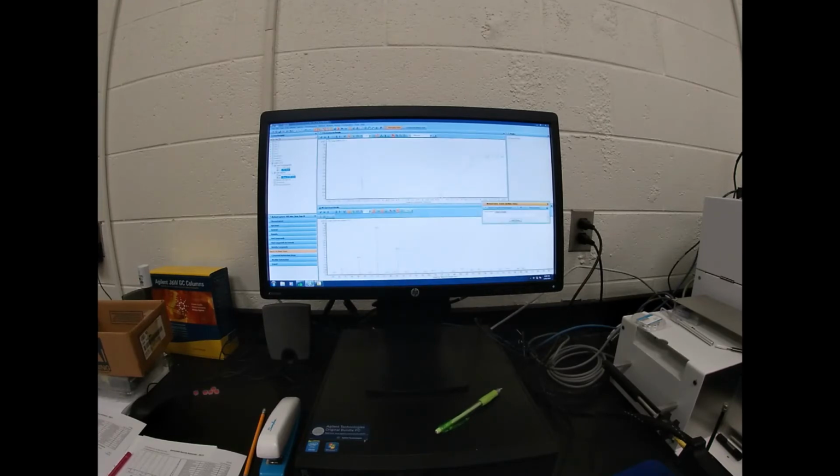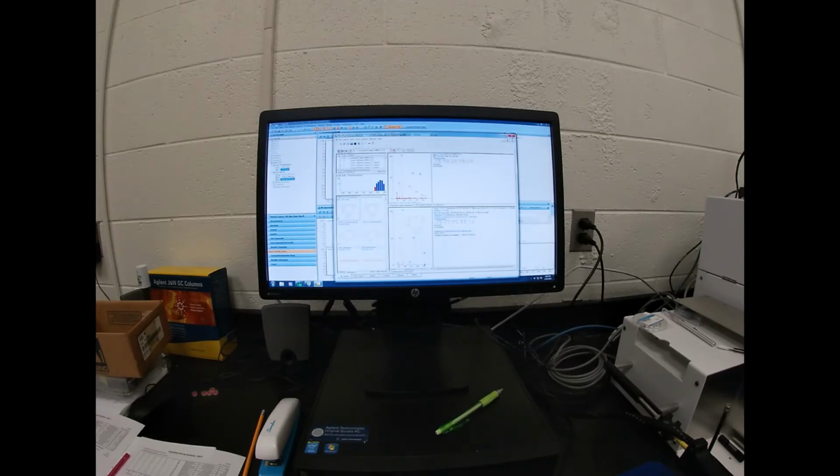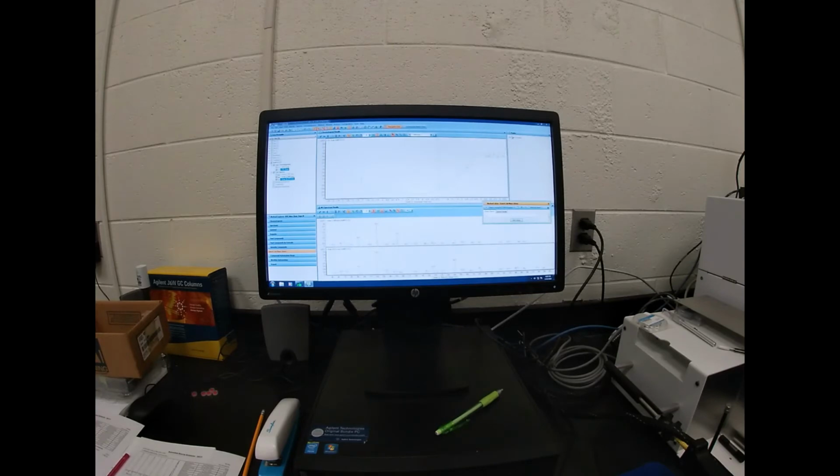And what do we see over here? That's this one, and so if we do a search, we have another, I don't even know what that is, but it's definitely not related to our aspirin. That's a strange one. I don't think I've ever seen a molecule that looks like that. It could be a breakdown from the septum or the column. Makes some weird things like that.